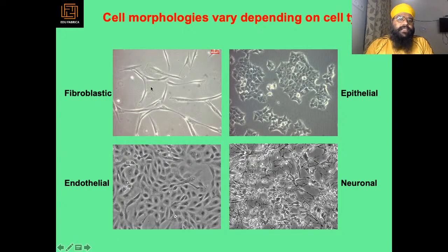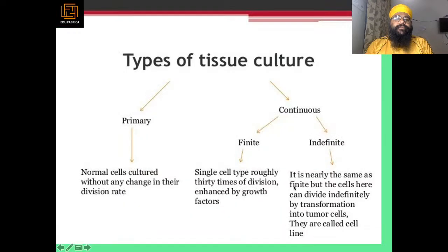You can see the cells being separated from each other, very tiny and in elongated shape. The epithelial cells here are more condensed into this network, we can say spider web, and this is more like dense and flattened cell types joined all together, the endothelium. These are the neuronal cells, shiny from the center part, because of the neural activity. So all four different cell types are all different from each other in morphology.